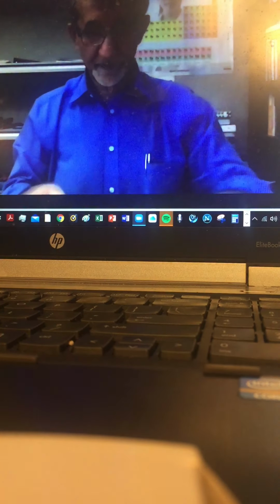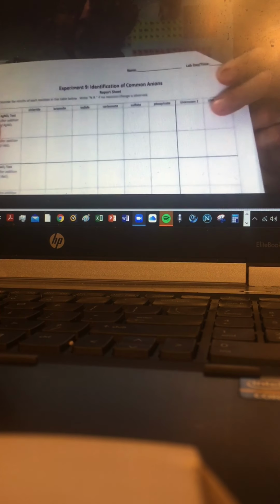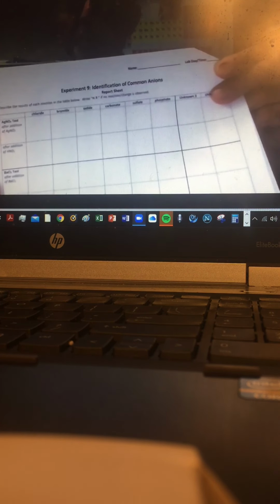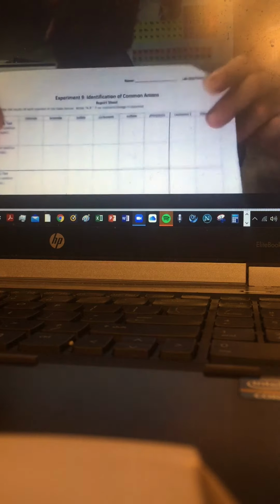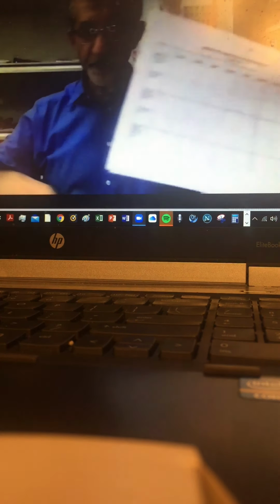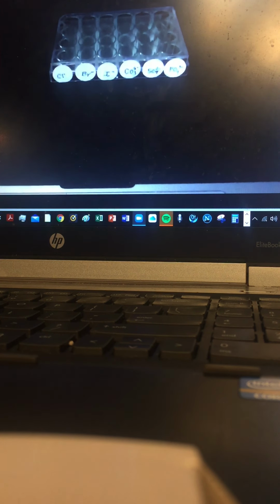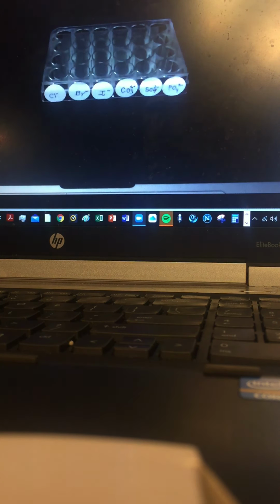Flip the page. I don't have a page number, but this is the beginning of that table to be filled out. This must be page 74, so turn to page 74, and I'll be showing the following. I have a replica. This is a replica of that page.